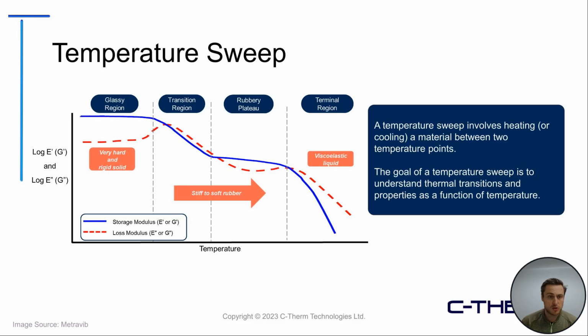And the reason I say transition region is because there's multiple ways to measure this glass transition temperature between the glassy region and the rubbery region. And it really depends on what method you're using: DSC, TMA, DMA. And even with DMA, you can measure this region by analyzing different viscoelastic properties as well, like your elastic modulus, your tan delta, and I'll go through those in the case studies today as well.